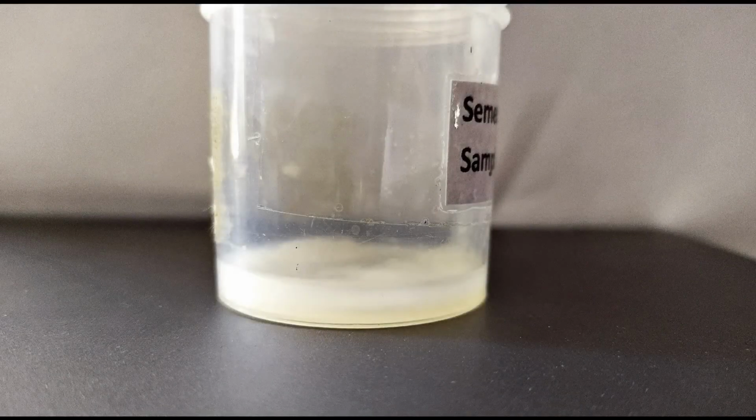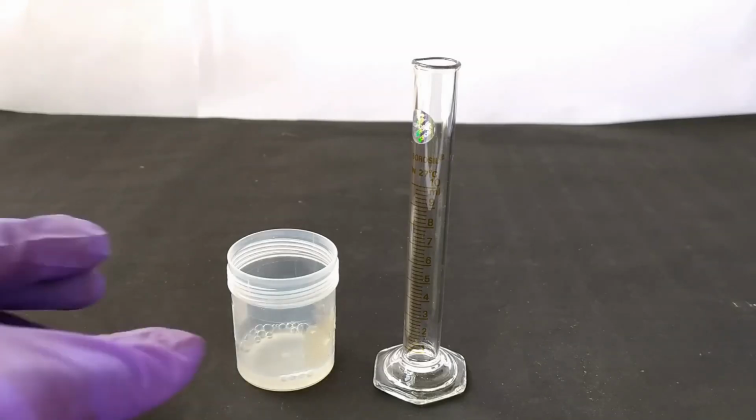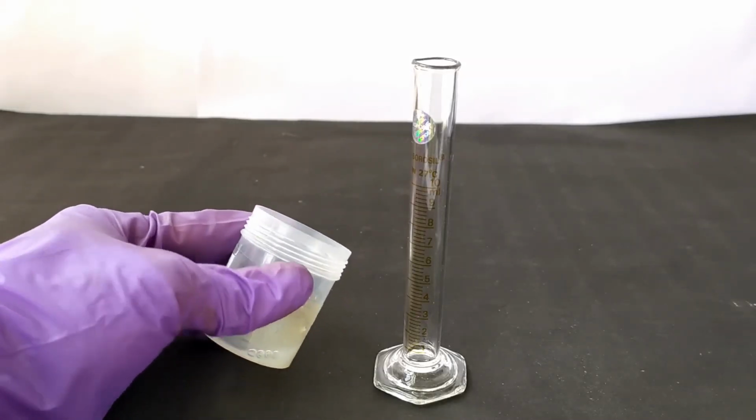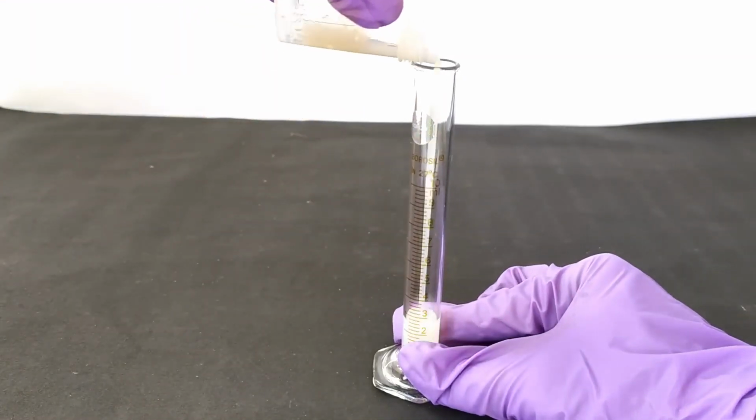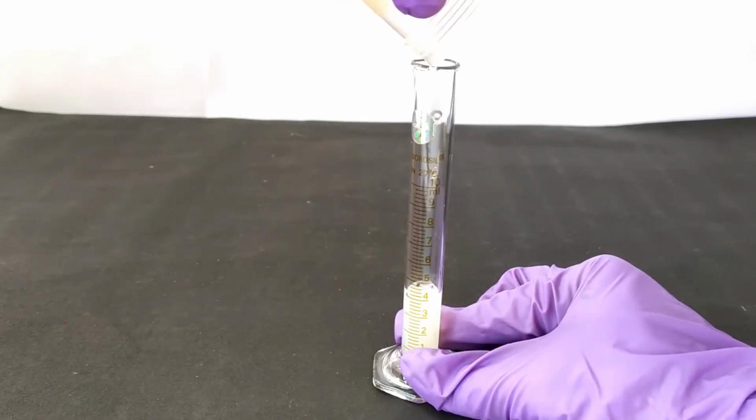Before estimating semen volume, the semen sample needs to go through the liquefaction period. Allow 10 to 30 minutes after collection for the sample to liquefy before measuring the volume. To determine the volume of the semen sample, tilt the sample container for a couple of minutes and then carefully pour the liquefied semen sample into a 10 ml graduated cylinder completely till the last drop.